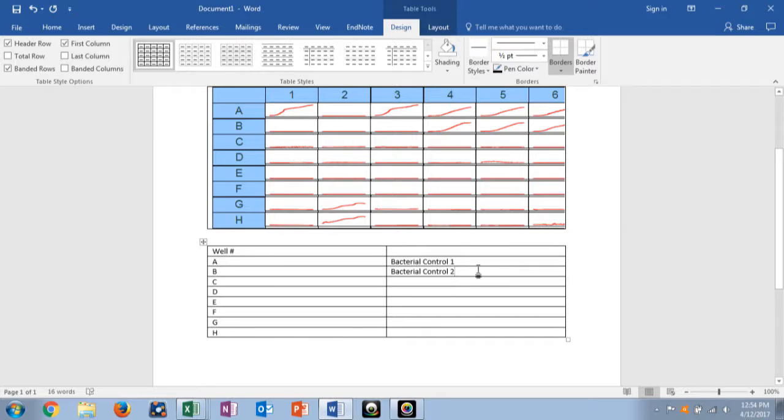So here you inoculated your bacteria, and you wanted to see if your bacteria grew at all, like if they liked the medium, and you're comparing how your bacteria grew to how they performed in the treatment. Like with this group, they had growth in their treatment and none in their bacterial control, which I think is suspicious. So I wonder if they flipped these wells around. So that could be a possible source of error.